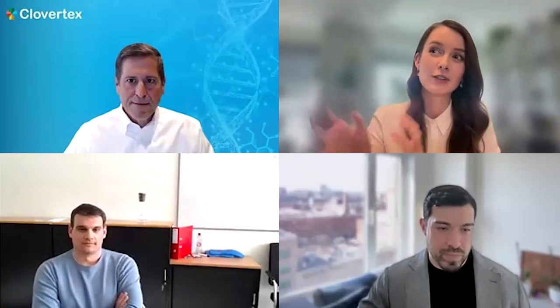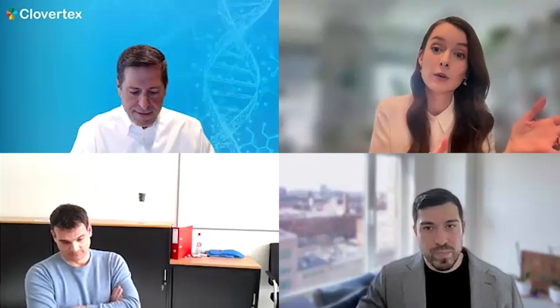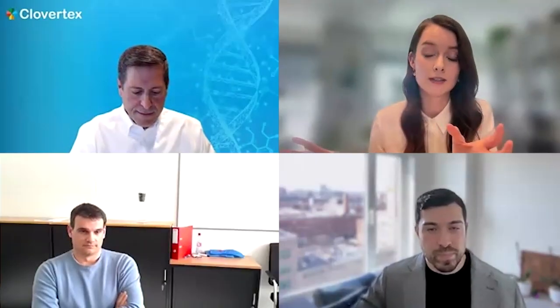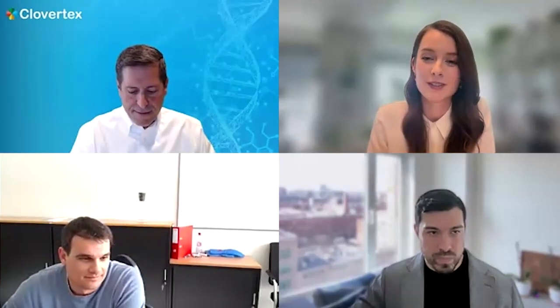And then the second thing I really noticed was the cryo-EM data processing infrastructure, whereas in academia, it's generally quite bespoke for the group. So you have specific infrastructure, mostly on-prem, but also some cloud computing. Whereas in industry, you have to fit that into the way that the larger company operates. And so that takes a little bit more working with IT and being sure that you can communicate your needs as a cryo-EM scientist for them as well. There's many other small differences, but maybe I'll just leave it there for now. Let the others introduce themselves.